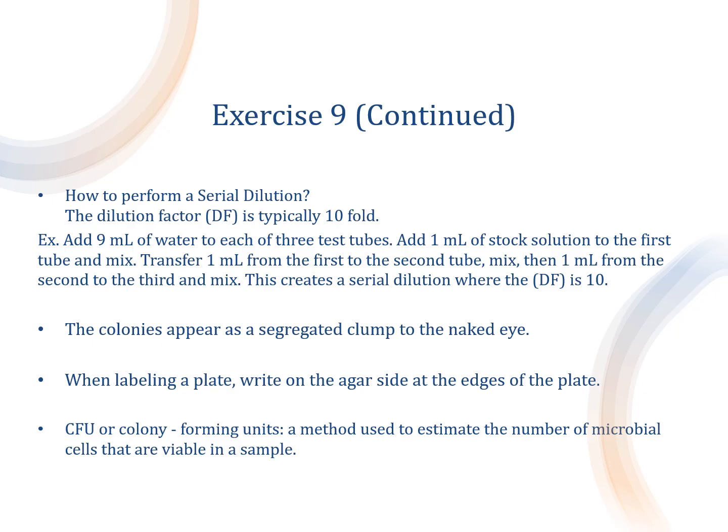And then, true or false, you should always blow on your inoculation loop. You should not do that. That's false. It says you should always blow on it after heating it. That would be bad because that would contaminate the loop with bacteria in the air from your throat, mouth.